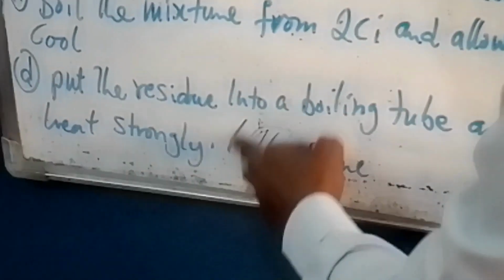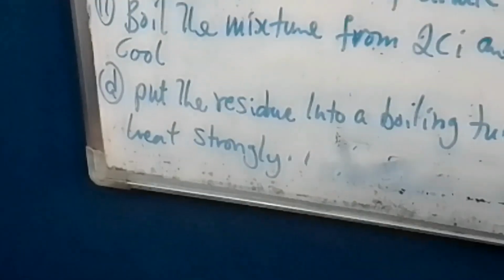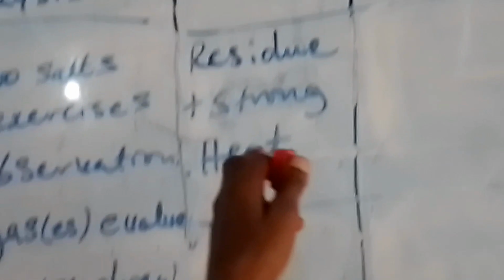Alright, the fourth test said put the residue into a boiling tube and heat strongly. So residue plus strong heat.